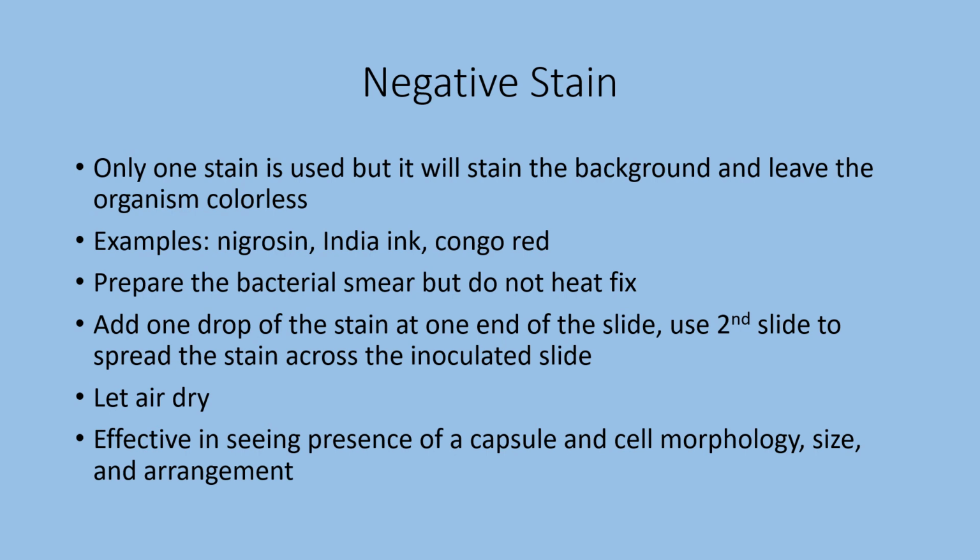So to prepare to do this, you take your bacterial sample and smear it on a microscope slide. However, do not heat fix it. After the bacteria has been smeared on, you add 1 drop of the stain, and instead of adding it to the middle of the slide, you add it on one end.